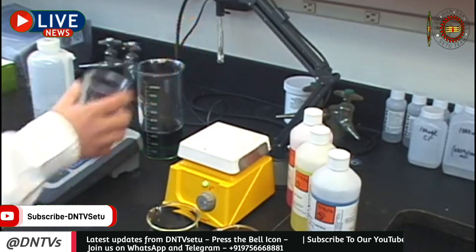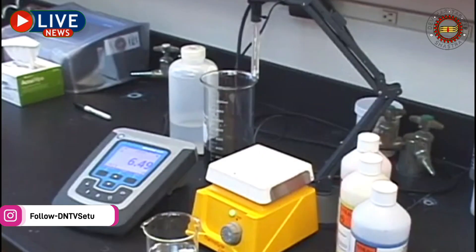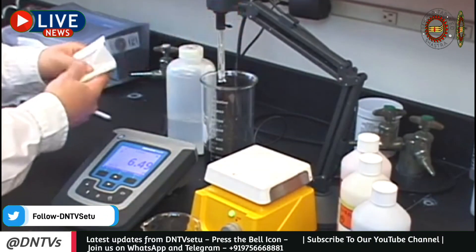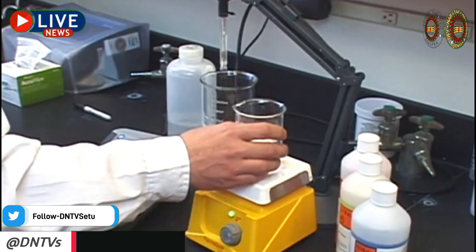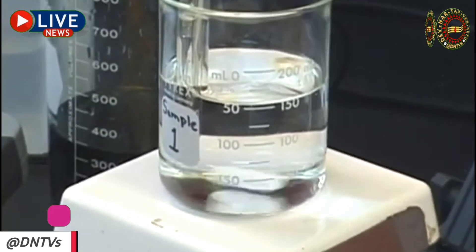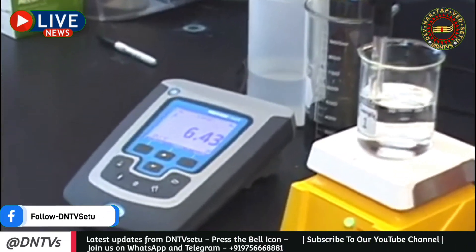Now that you have calibrated your meter, it is time to take your measurement. Since you properly calibrated your meter, measuring samples should be easy. Just as with buffers, it is important to always use clean containers to avoid potential contamination of your sample. Place your electrode in the sample and press read on your meter. Some meters have an auto-stabilization function, which can help with accuracy — this feature locks in your pH reading once the meter determines the electrode is at its most stable point. Once the reading is stabilized, your meter will lock the reading on your display for you to record. And it's as easy as that — you have taken your pH measurement.